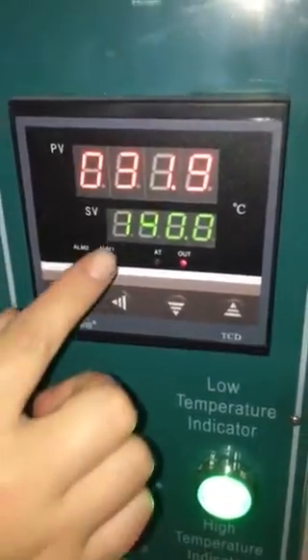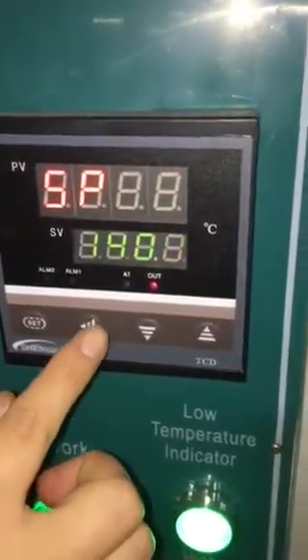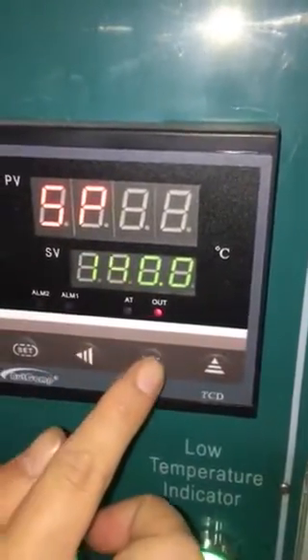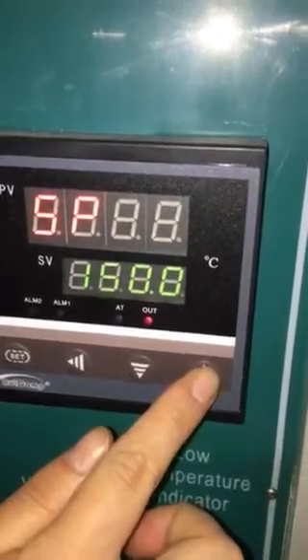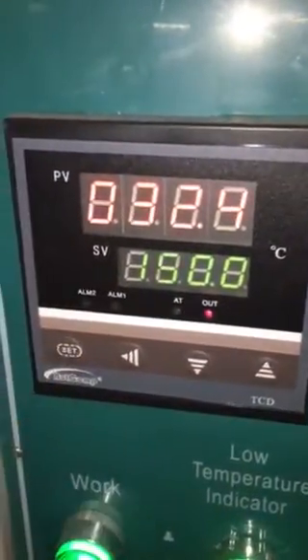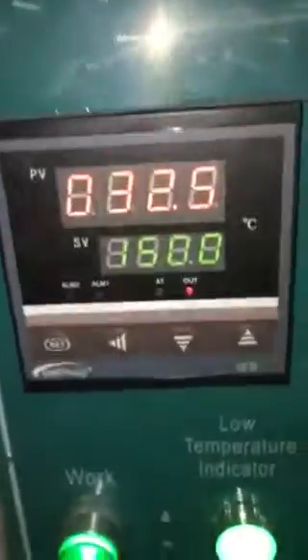Now we set the temperature. If you want to choose this, up the temperature, then confirm. You see, now it's working. The temperature is okay.